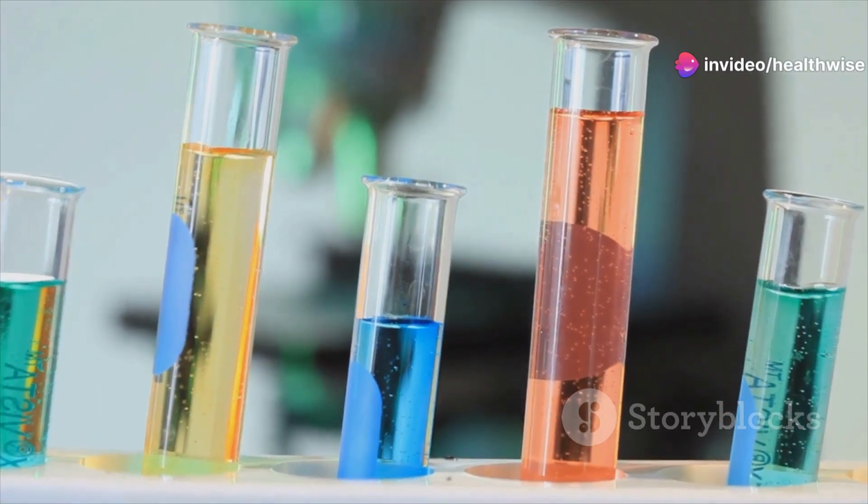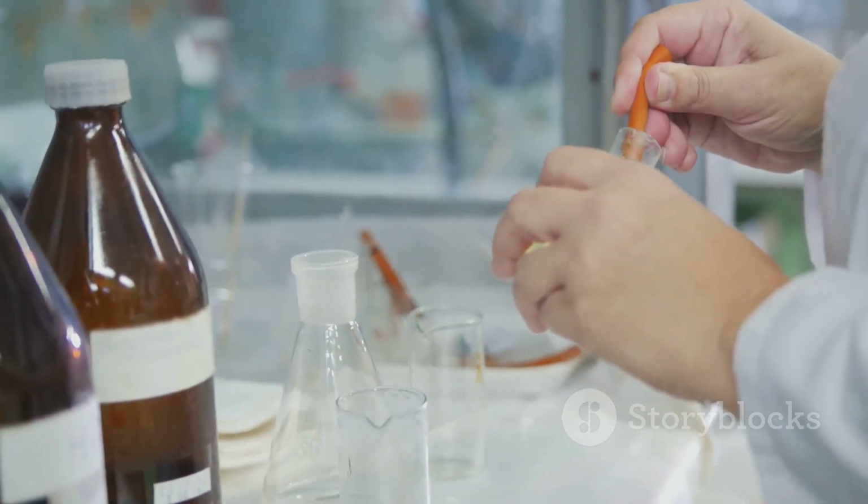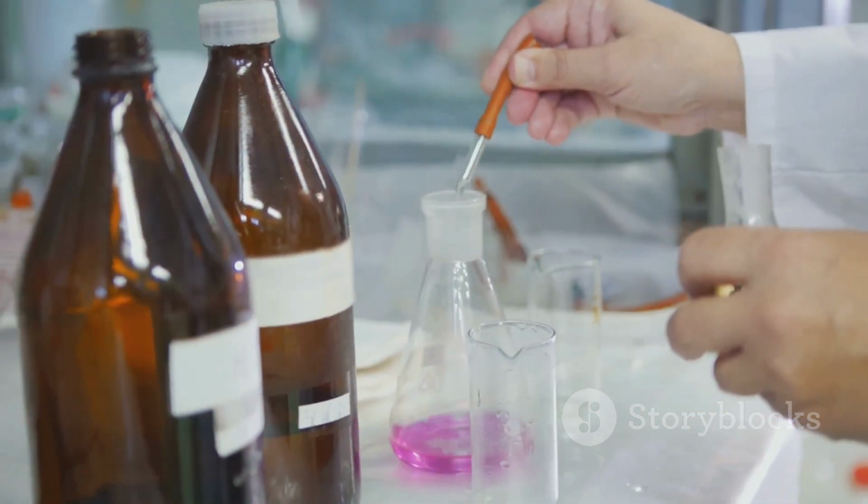Thin layer chromatography can be done in one dimension or two. In two-dimensional TLC, you run the plate in one direction first, then rotate it 90 degrees and run it again.